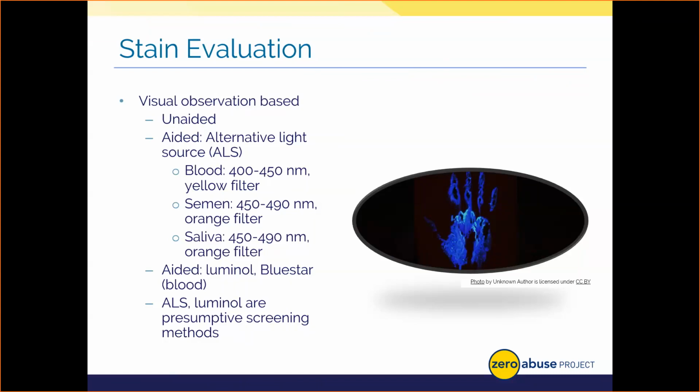In fact, the landscape study on ALS from the Forensic Technology Center of Excellence is a fantastic resource, and this is provided in your handout in the slide notes that can help you determine the best ALS for your testing needs, and it really showcases the best wavelengths for a given stain. As you can also determine, some ALS wavelengths of light do overlap. As such, ALS is a presumptive type of testing method and only used to screen for possible body fluids.